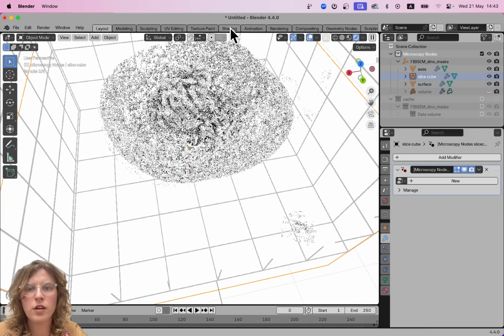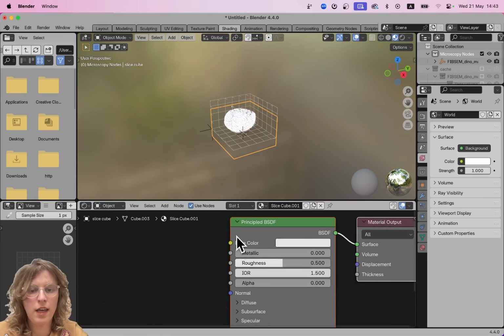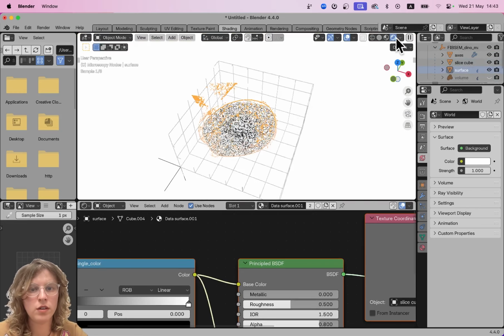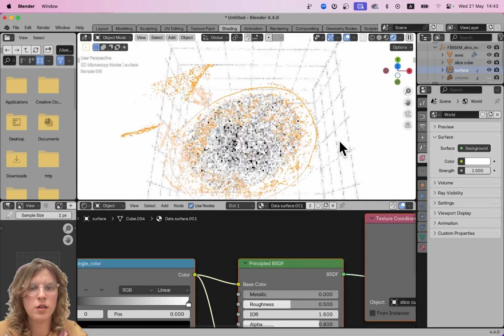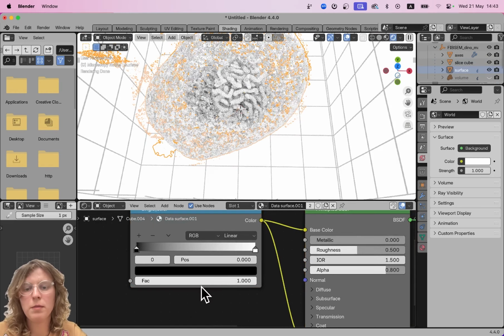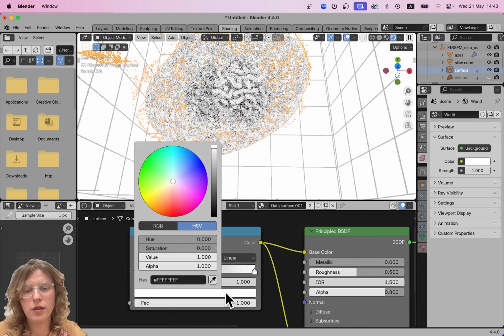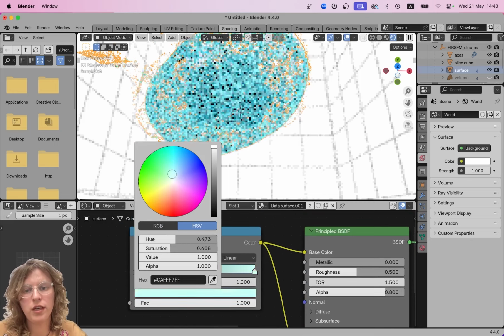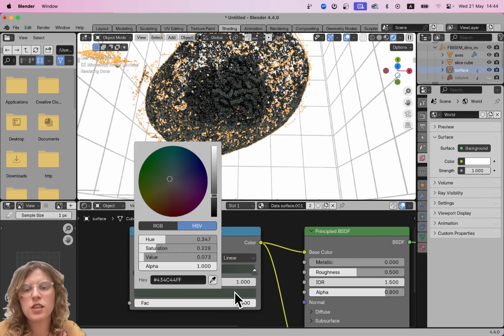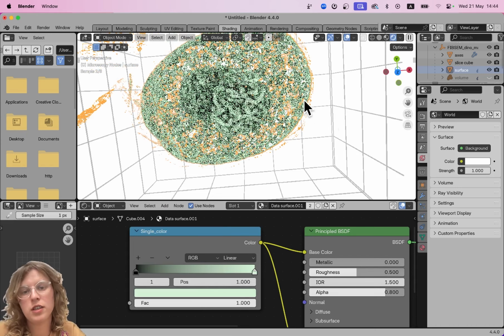And so let's look quickly at how the shader works for this, so how the colors get applied. In our shader for the surface, we get a color map, but that's actually not a real color map because this only has a single value, and so if we just change the last value here, we can change whatever color this has. And that's because essentially there's no other way to assign color than to just give everything a similar color.